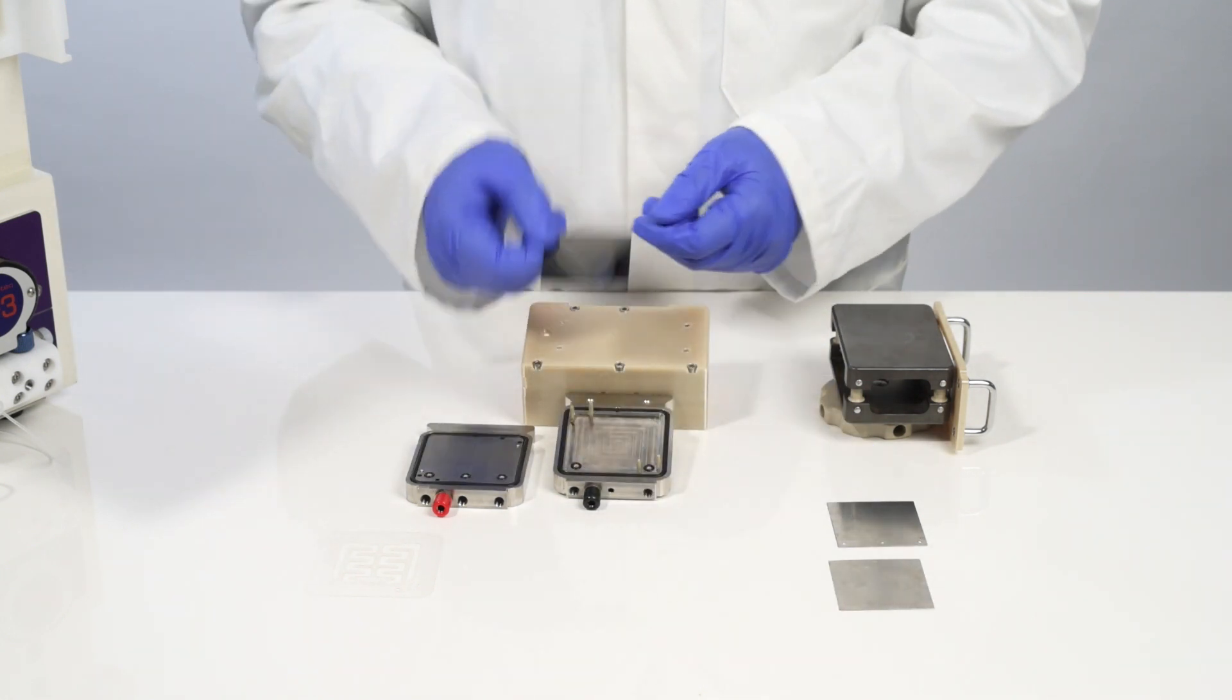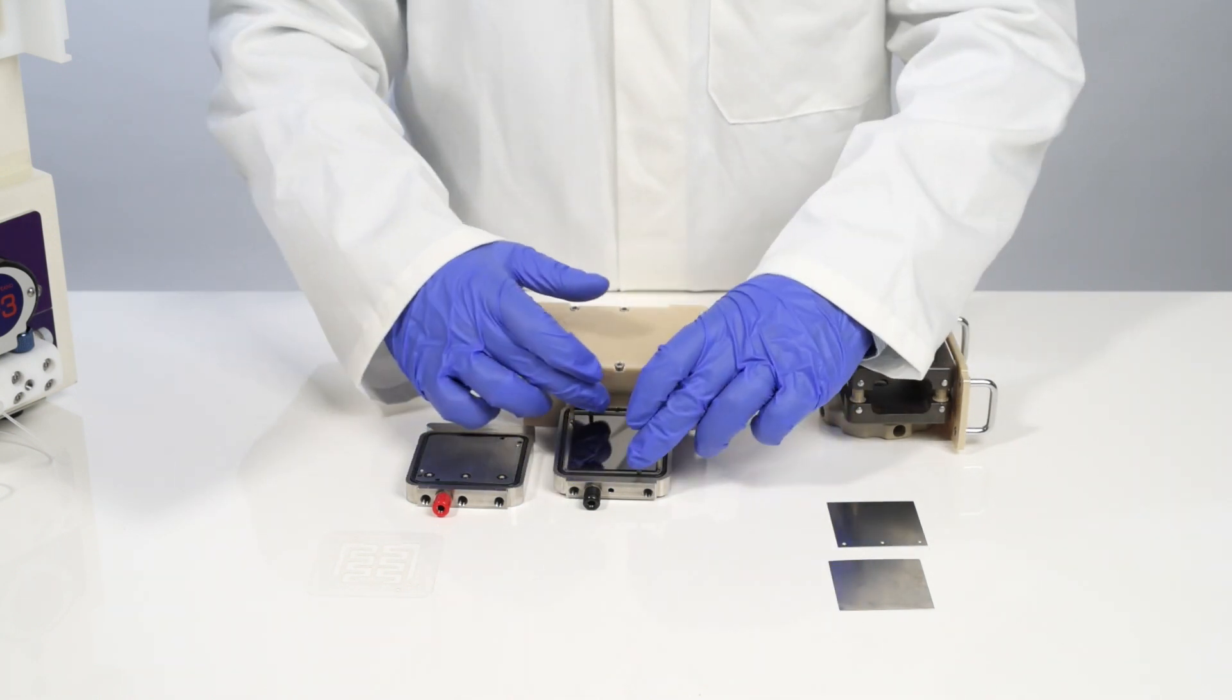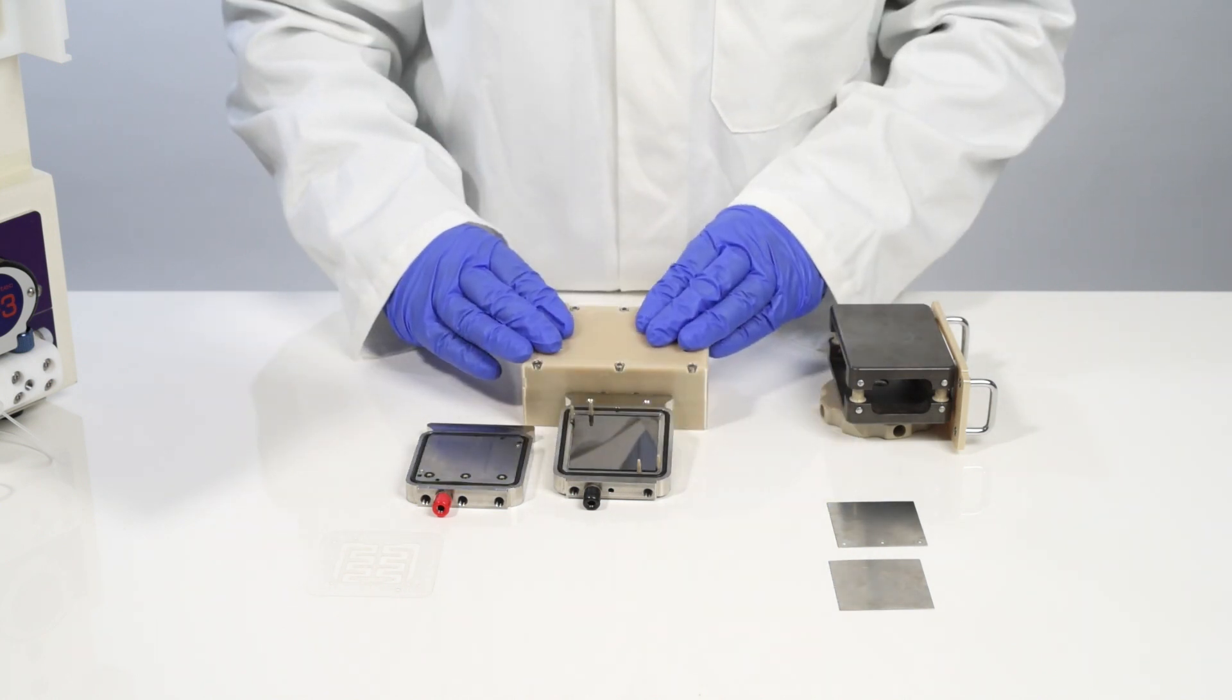I'm going to replace it with a carbon electrode. The electrode is located by these two pins here and just sits flat on the bottom of the electrode carrier.